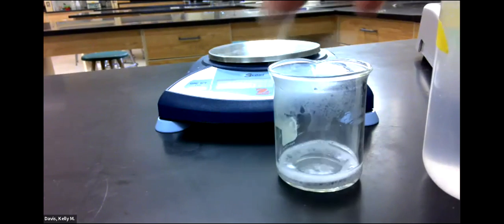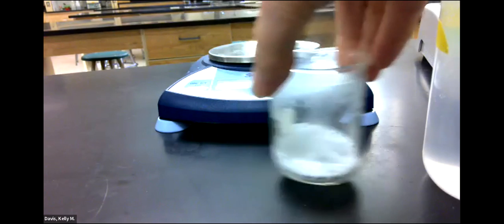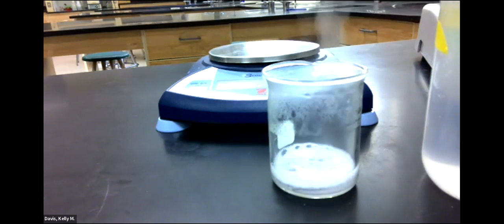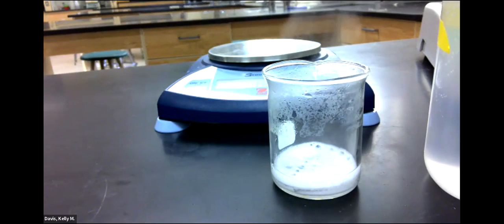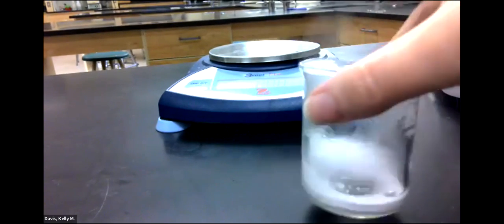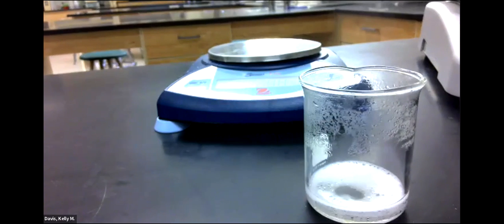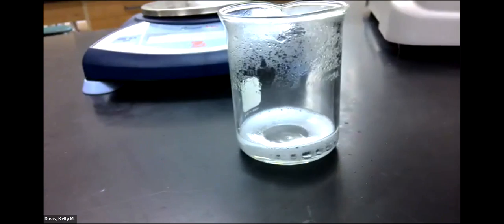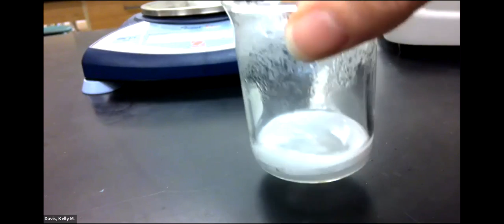So I'm gonna swirl this. It's definitely warm. Let that react. I want to see if all the magnesium has reacted. I'll let it go for a few minutes here. I'll know when the magnesium has all reacted because I won't be able to see any more magnesium. So it's getting there. I think there's still some magnesium left.